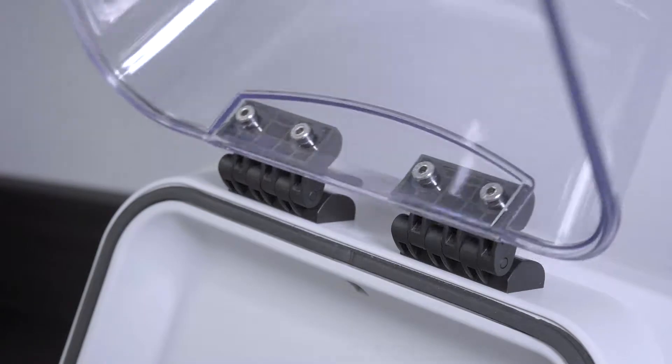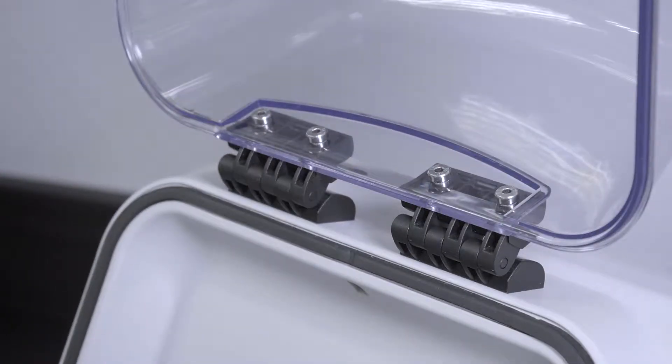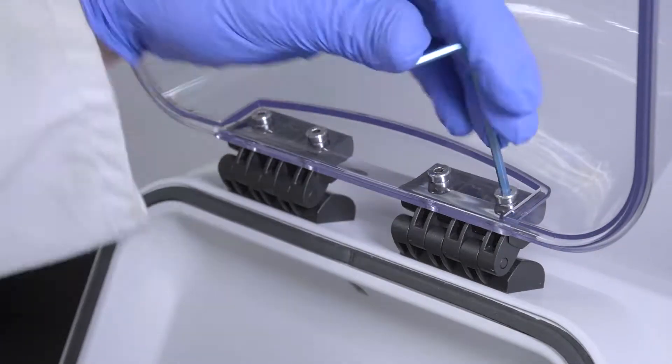To begin, lift the lid of your BeadRuptor homogenizer and use the provided Allen key to remove the four fastening screws.